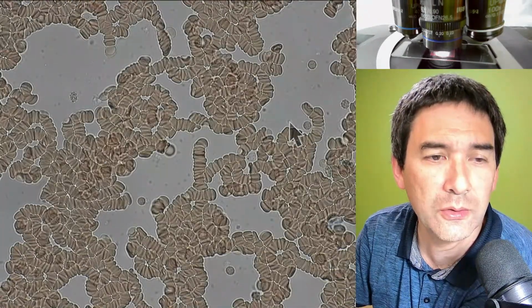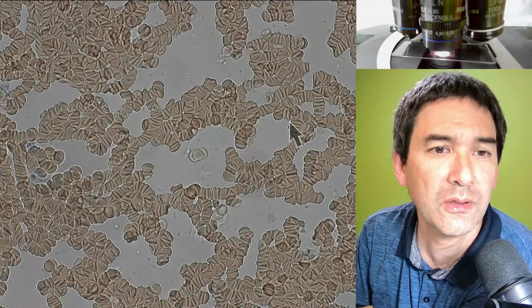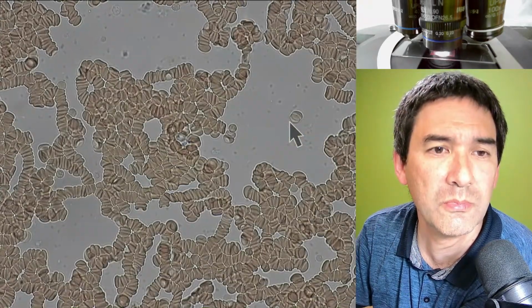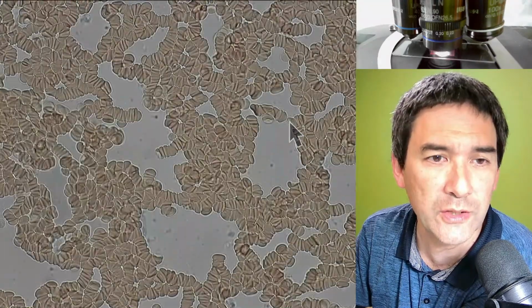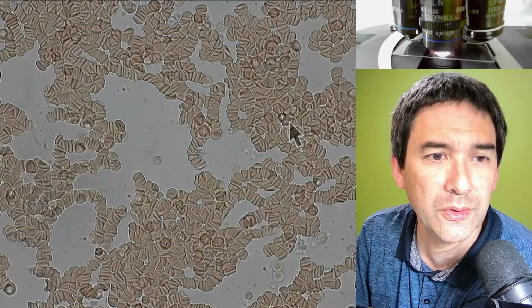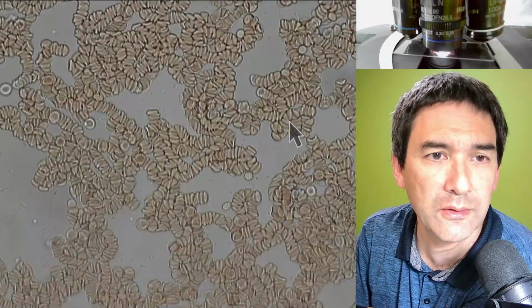Either I did not use enough of it, but it actually did look quite dark. But I think we agree that probably the other one was better, and now they're really trying to stack up a lot as the blood starts to coagulate.